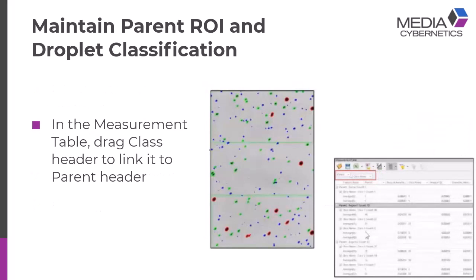Once I've done that, in this case, for each parent region, I now have the distribution of all the particles, in this case spray drops, for a region. It's a big data table. If this is the data that you're interested in, I want to do a distribution analysis of these particles within this region. If you have multiple regions, I can do that. In this case, in this group, they're looking at dental material, a dental implant titanium screw, and they want to measure all the screw shavings, or all the little titanium particles that have come off, and measure it within regions. And then, they were doing further distribution analysis. This is the latest example of this.